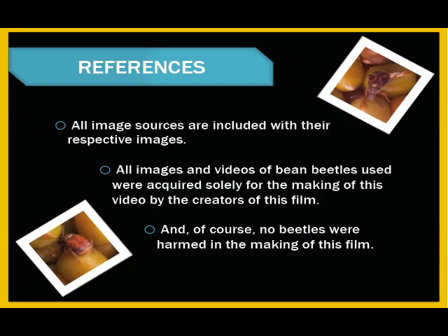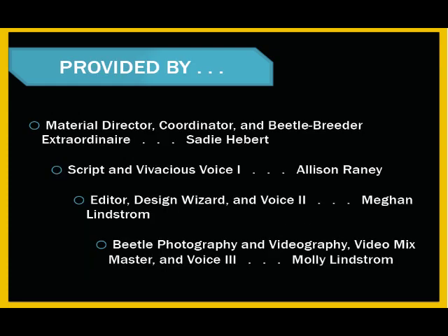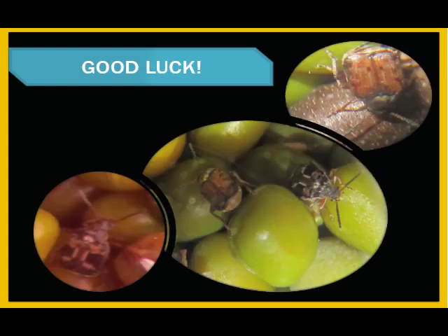Hopefully this video has helped you learn more about the diversity of life as well as how to determine the different sexes of bean beetles. Once you begin to recognize the inherent differences between the members of this sexually dimorphic species, determining the sexes of your bean beetle should come easily. Good luck with your sexing!